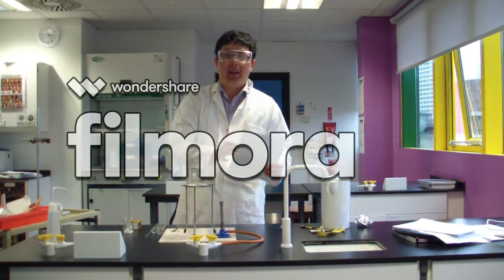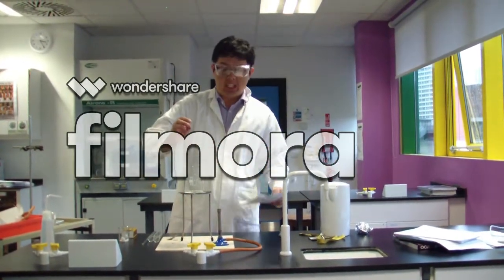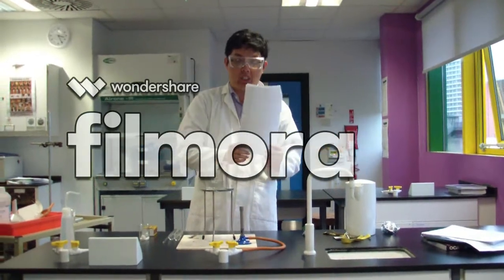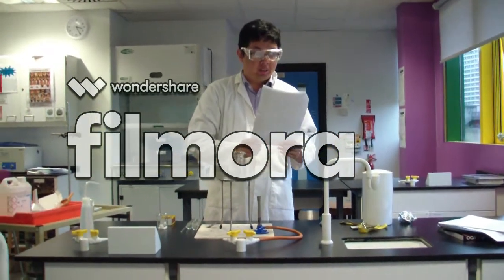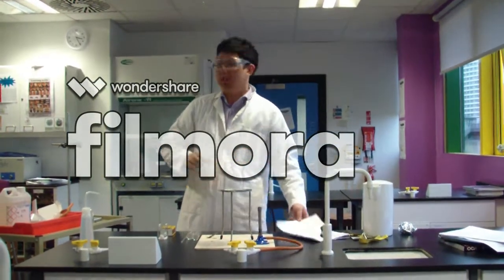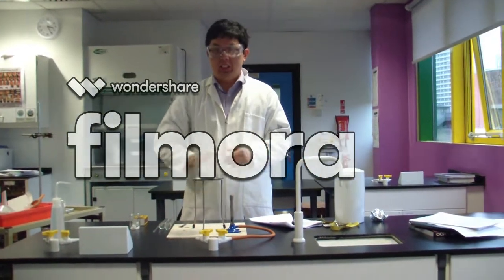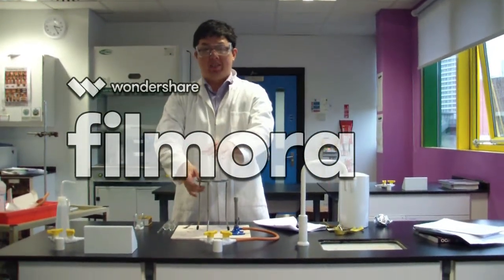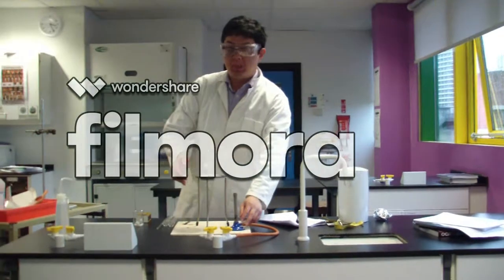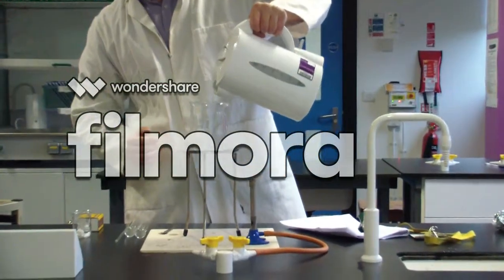Preparation of benzoic acid, Part 2, Part 1, recrystallization. If you read your instructions, it says set up a water bath and place the boiling tube in the water bath. Unfortunately, we do not have a water bath that goes up to 100 degrees. So what I'm using is a beaker on a tripod with a Bunsen burner. I'm going to pour some hot water inside the beaker, and this will act as a water bath.